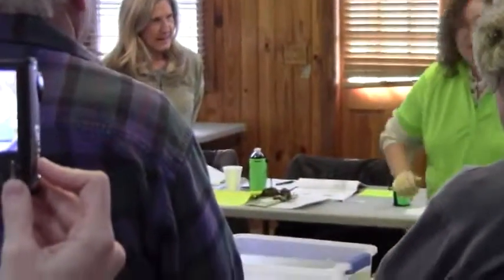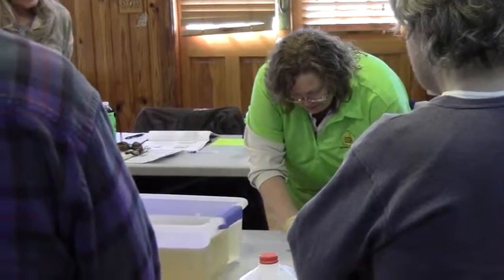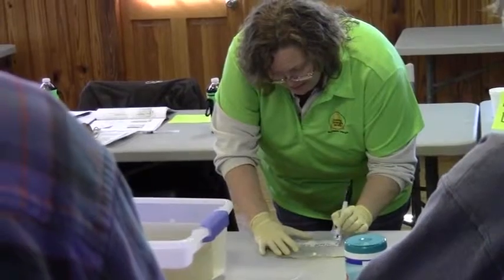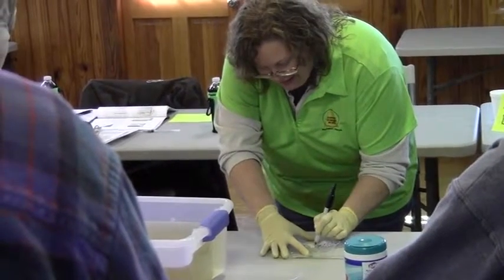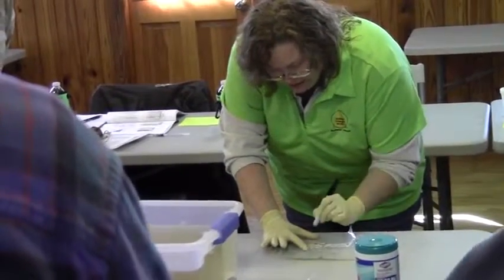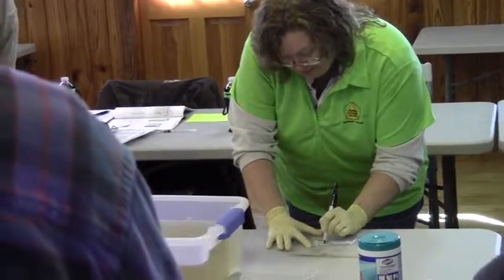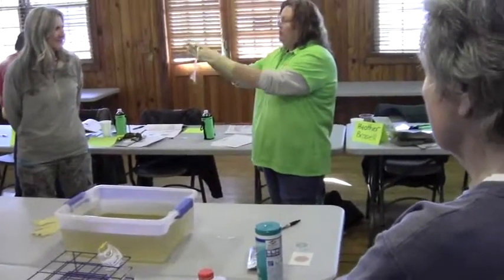So what is the very first thing that we need to do? It is 110, sample one, and we are at Ray Bingham, so that is going to be our site range. And then my name, and then the time that I pulled the sample — it is 3 and 7. Okay, so all of this is now labeled, so I know where it came from and what we are going to do.